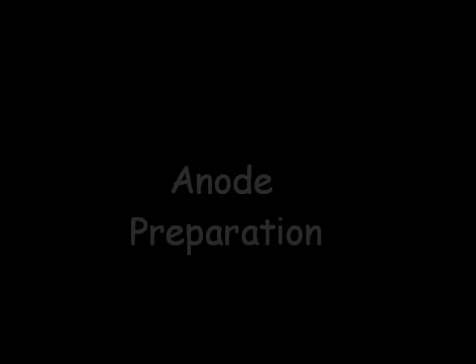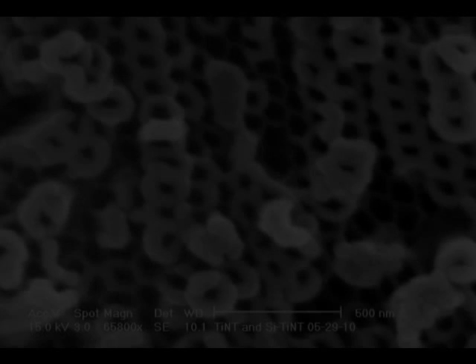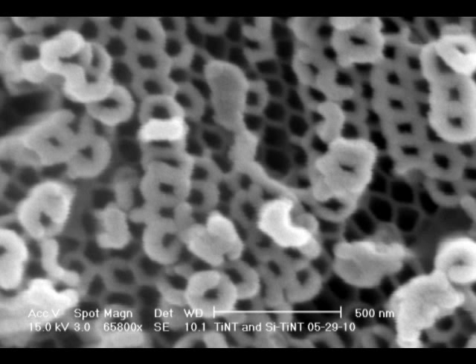The plates are then prepared for silicon deposition. Silicon nanoparticles are deposited as a thin film by the process of sputtering.